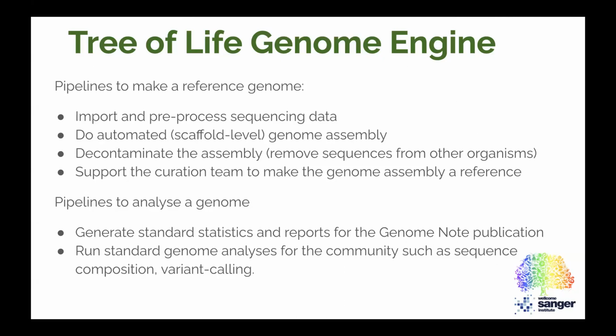And related to that, we run a bunch of standard genome analysis. Some of that we report in the publication, some of that we share with the community: within our department, within our projects, and with any user who wants to use the data. Things like variant calling, for instance.